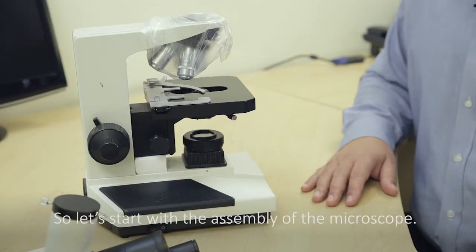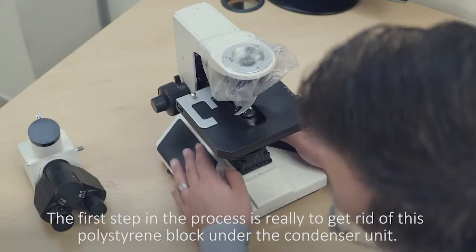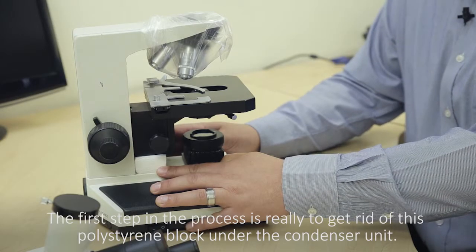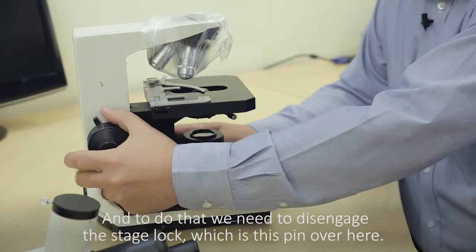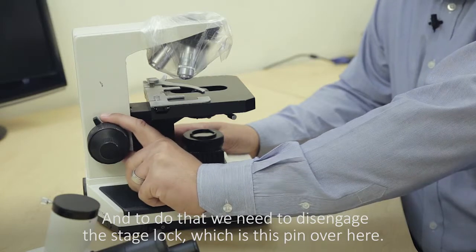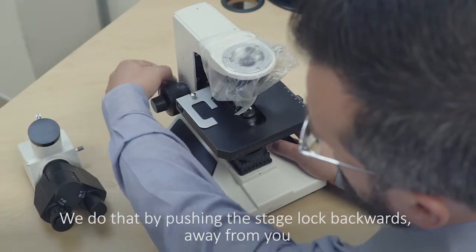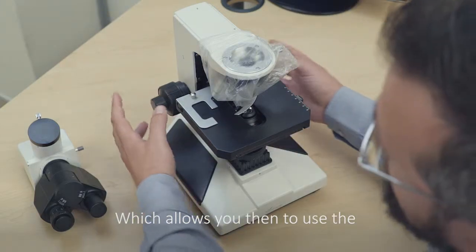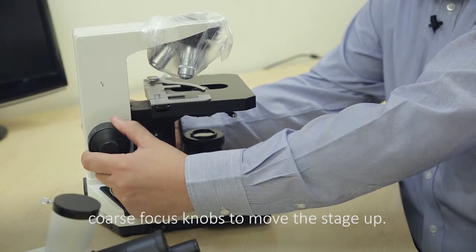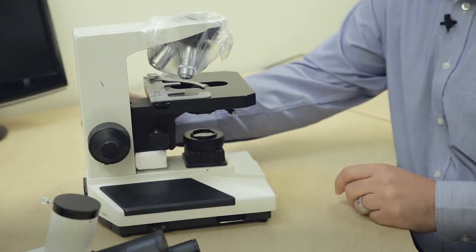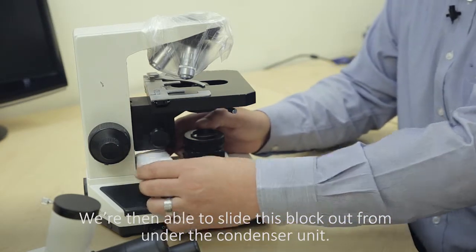So let's start with the assembly of the microscope. The first step in the process is really to get rid of this polystyrene block under the condenser unit. To do that we need to disengage the stage lock, which is this pin over here. We do that by pushing the stage lock backwards away from you, which allows you then to use the coarse focus knobs to move the stage up. We're then able to slide this block out from under the condenser unit.